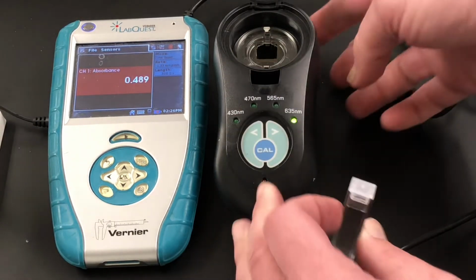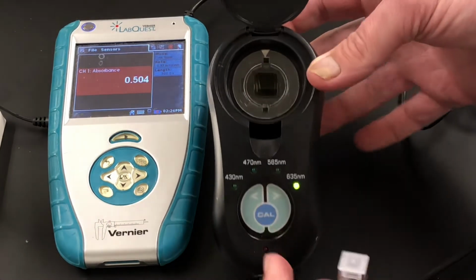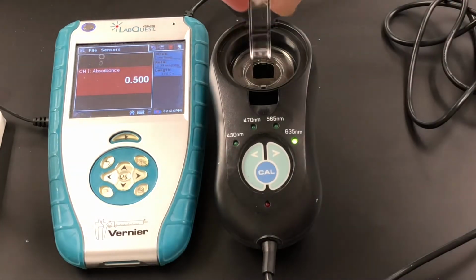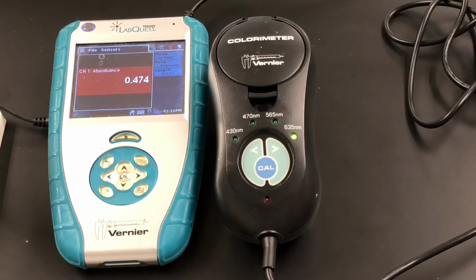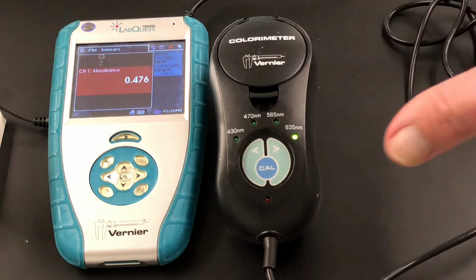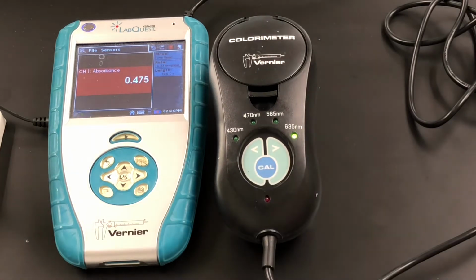When we look at this, we see a little triangle here. This is the path that the light is taking, so we're going to make sure that the clear sides always go in line with that. We'll set it in and close the lid, and then we're going to calibrate it to our sample. It's going to remove all the absorbances that we're reading right now. So we'll go ahead and hit calibrate.